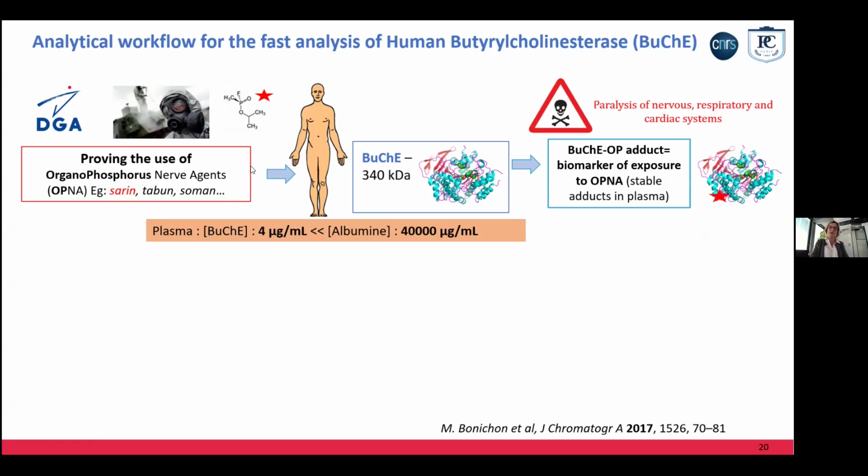So the idea was to find how to develop a very efficient, fast method to detect this exposure to chemical weapons. So the idea is to detect this small molecule attached to this very big protein.